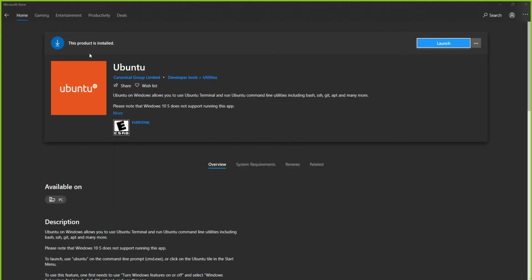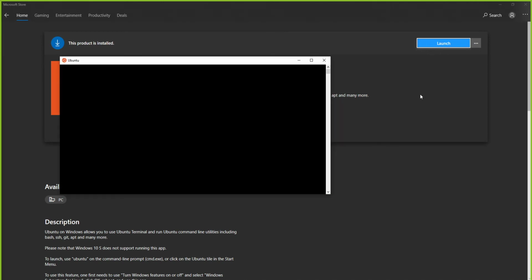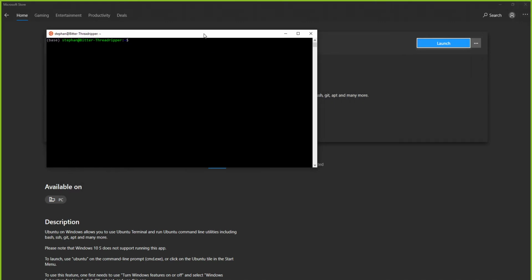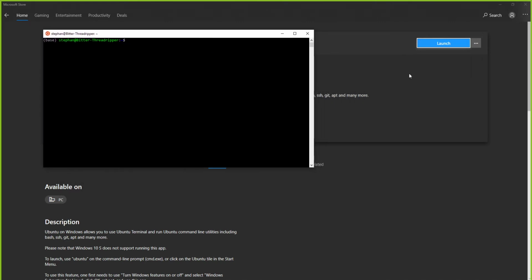So in this case, why don't you just try installing this one, the first one. Just do Ubuntu, install. Okay. Once you have that installed, launch it, and then we'll go from there. And if you have issues doing that, then we have bigger problems. But it's nothing to be too worried about. We'll just delete everything on your computer. Simple. I'm kidding.